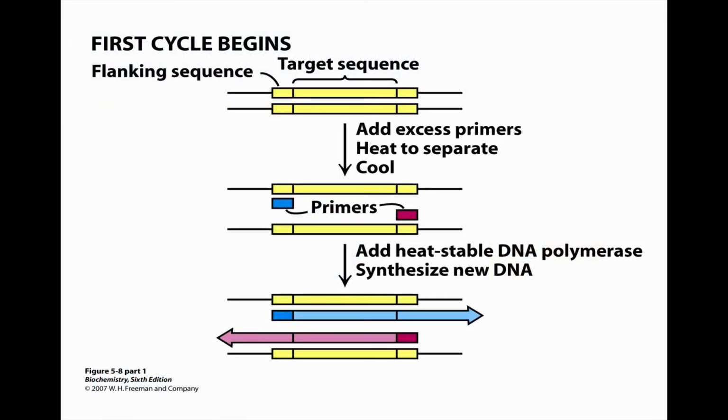So what we can do, even with detection, if I gave you, say, cells in culture and asked you to tell me was a particular bacteria contaminating that liquid media, well, if you have primers designed against the target region, so imagine these primers here were designed against the bacterial DNA that you want to see is contaminating the sample. Let's say there was bacteria there. These primers will find their target and hybridize by hydrogen bonding to their target.